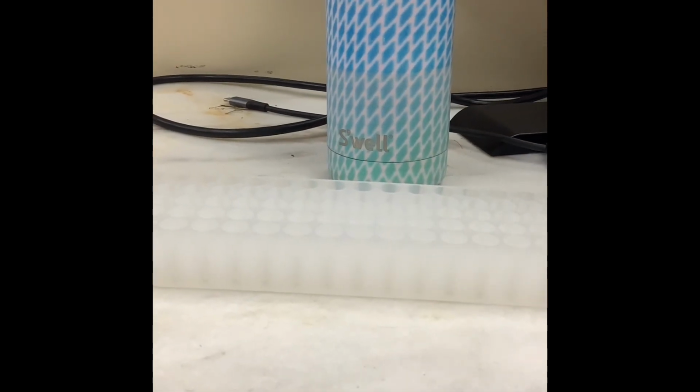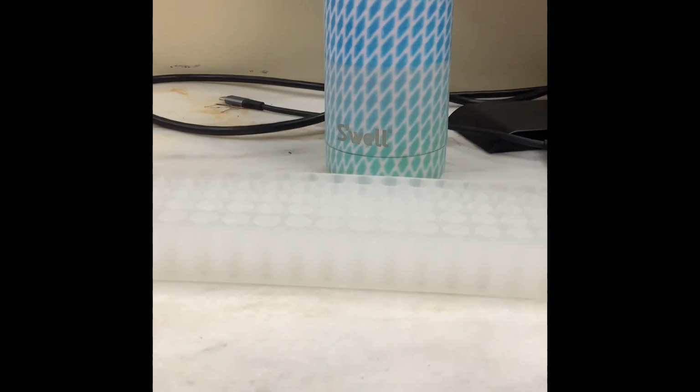Hello, today I'm going to be going over how you prepare samples for acetolysis.